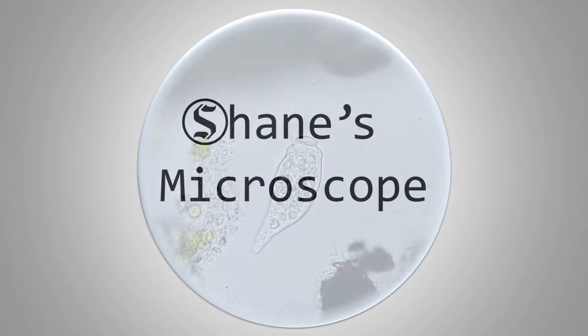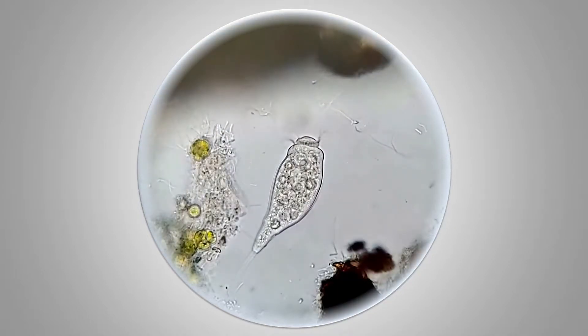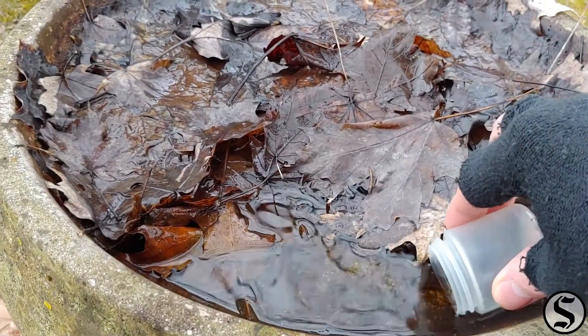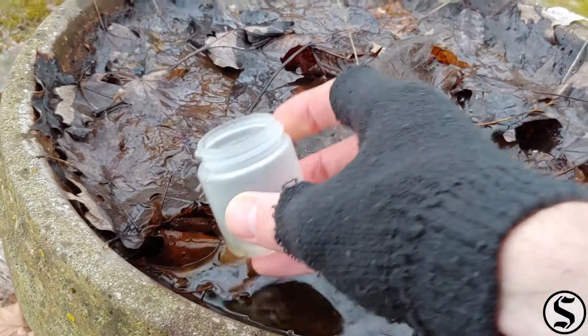Hello and welcome to Shane's Microscope. I'm Shane and this is my microscope. Let's take a peek. Today's sample comes to us from another birdbath.